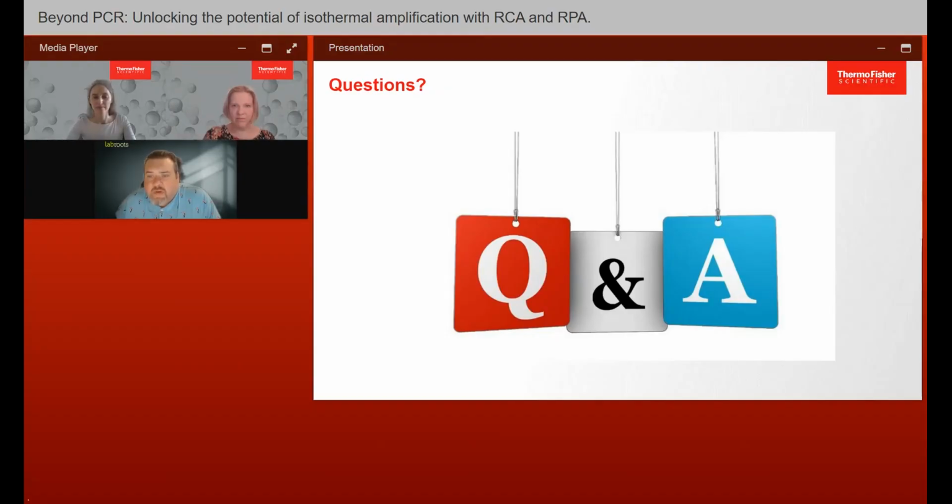All right, thank you. Another one for you. In several cases during the webinar, it was mentioned that RCA products can be used directly for downstream applications. Are there any downstream processes that require RCA product purification or modifications?